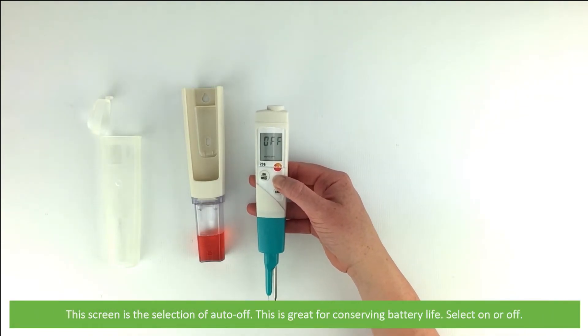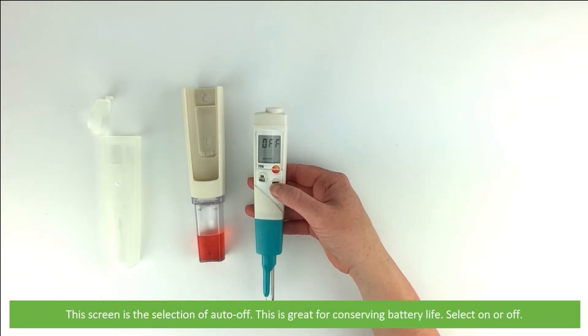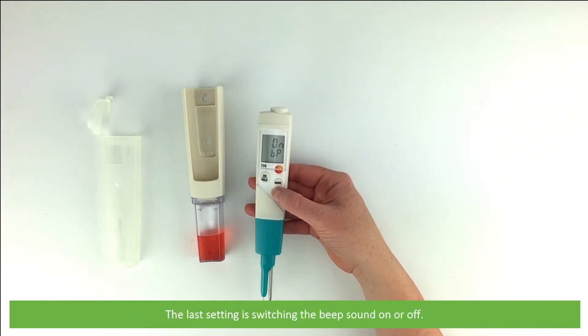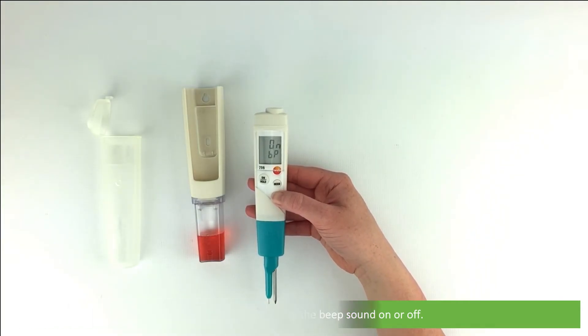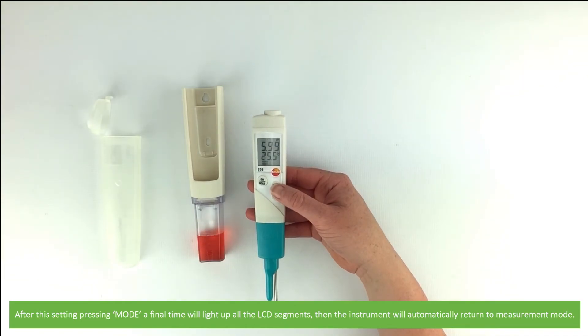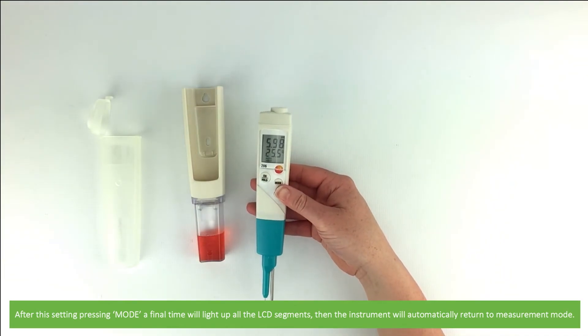The next screen is a selection of auto off, which is great for conserving battery life — you can turn this on or off. The last setting is switching the beep sound on or off. After this setting, pressing mode a final time will light up all the LCD segments, then the instrument will automatically return to measurement mode.